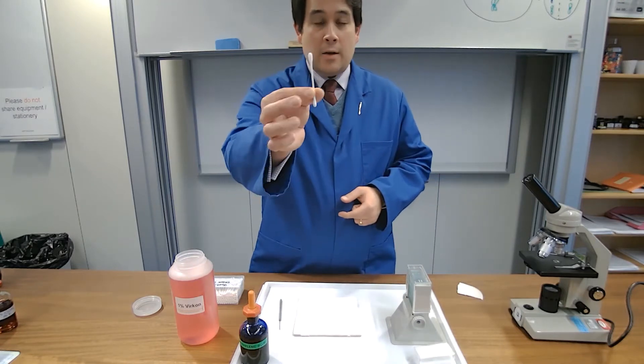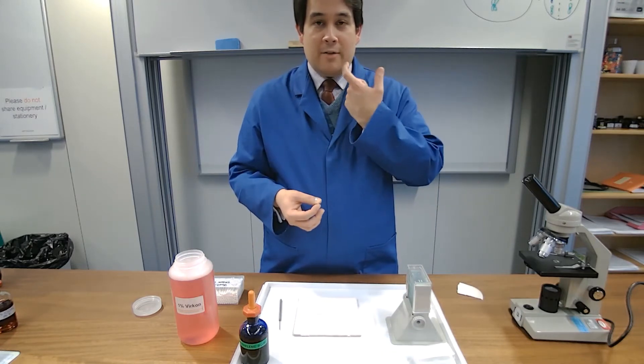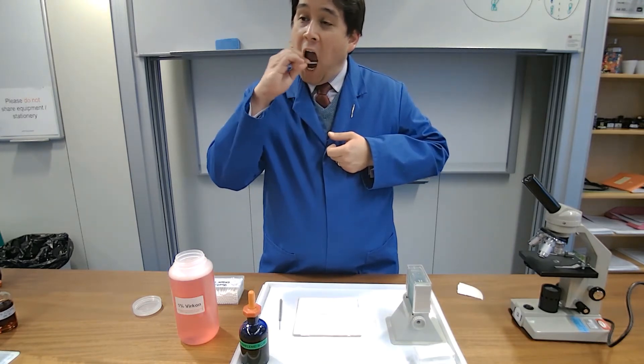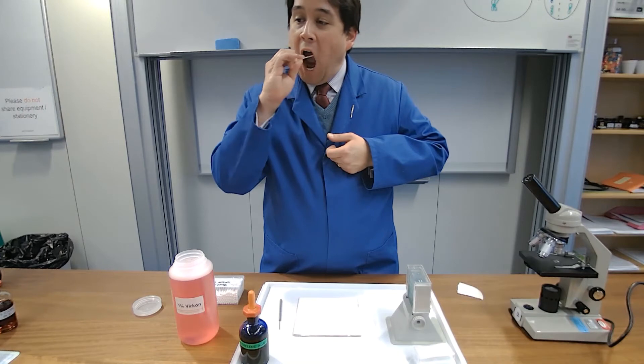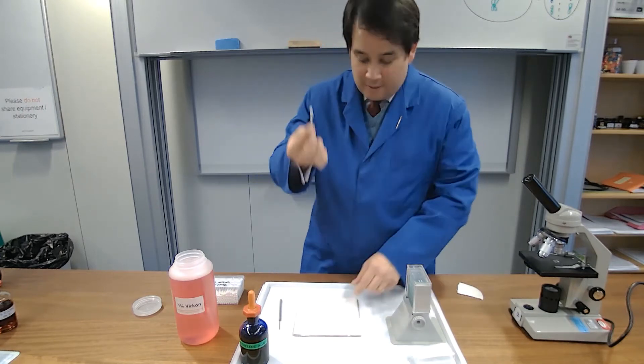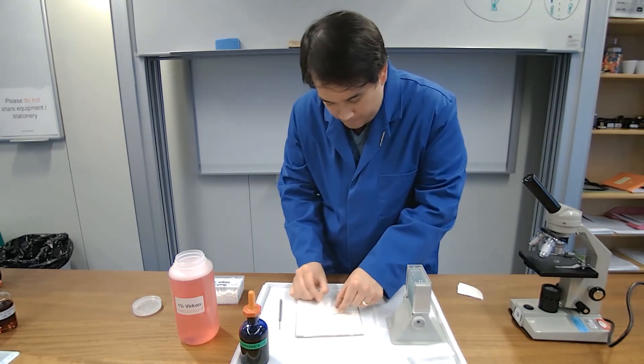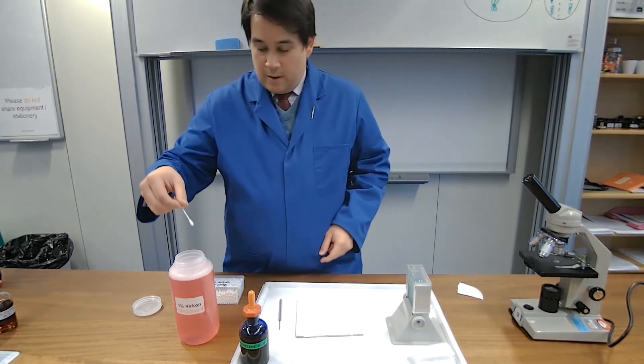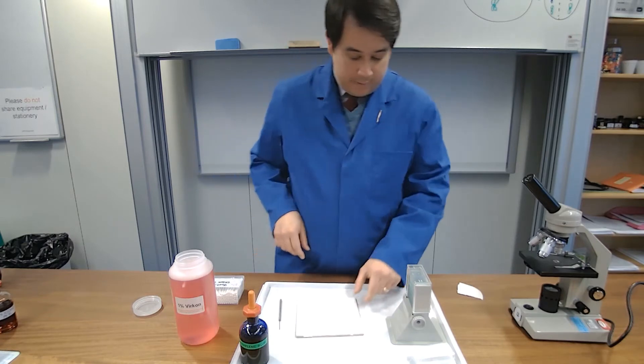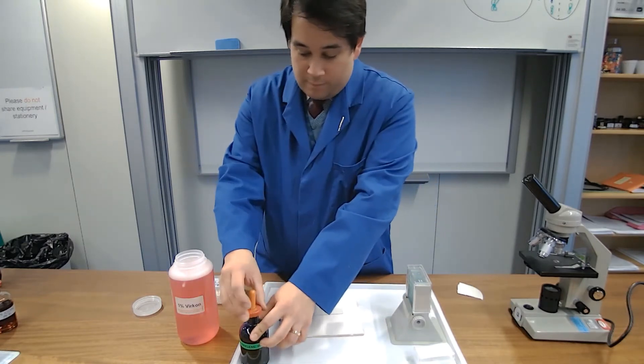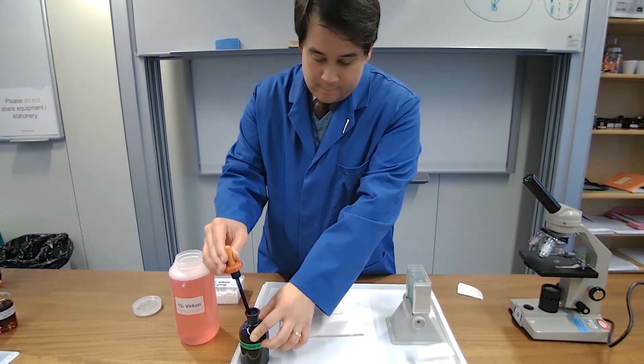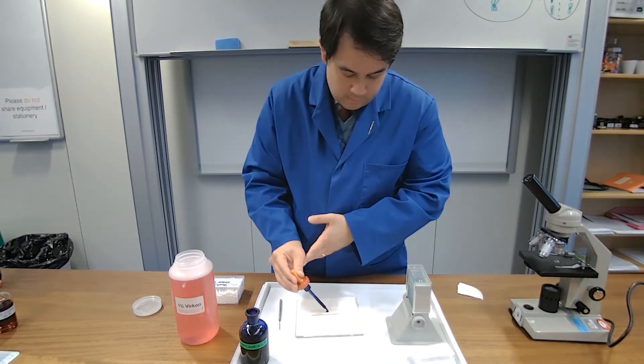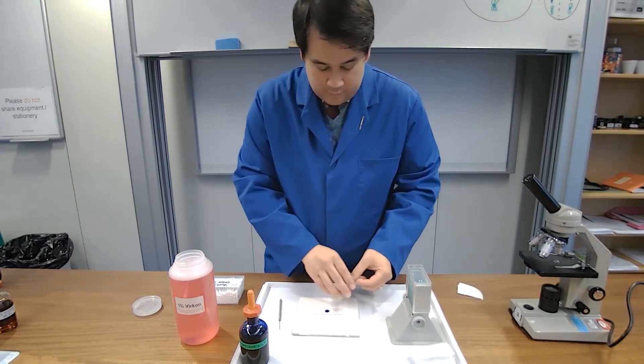So here we go, cotton bud at the ready, buccal cavity which is the inside of the cheek, scraping the epithelial cells off. I'm then going to put that straight onto the slide, cotton bud straight into the disinfectant, then one drop of the stain, all you need, cover slip straight on.